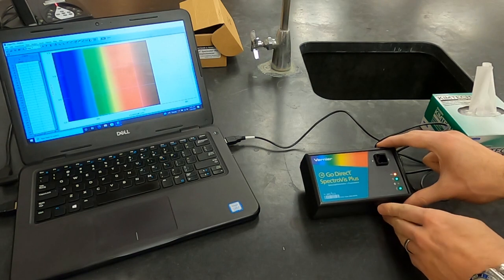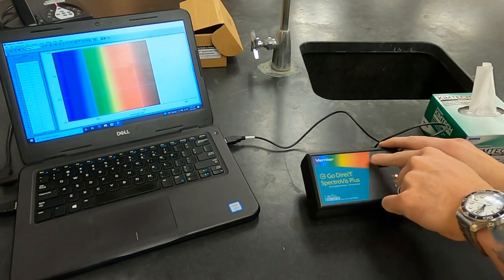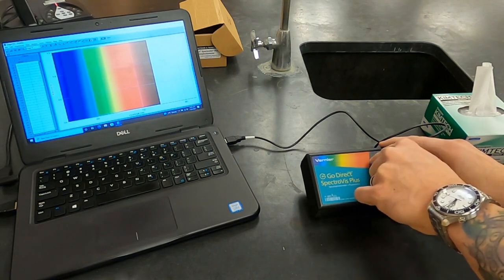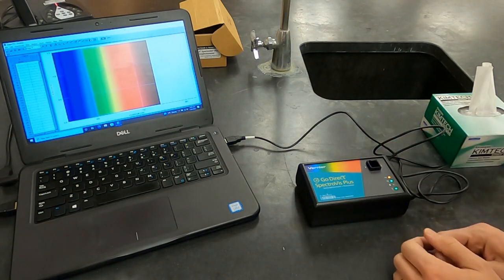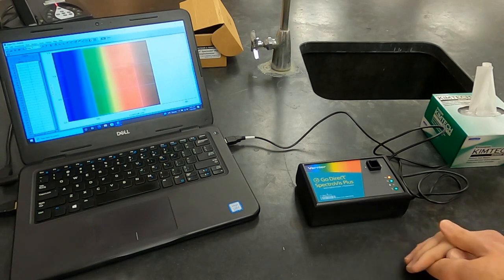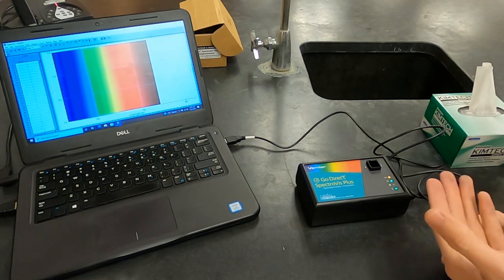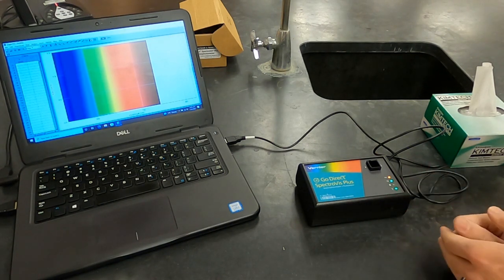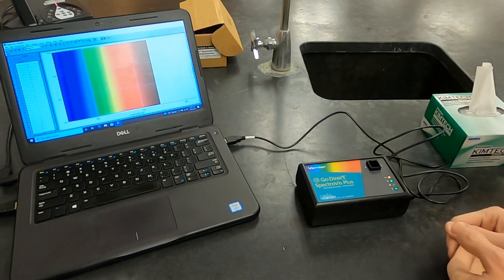What you need to note here is the white arrow here is showing that this is where light passes through. This is the path that the light takes. What this does is it shines light through a sample and it has a detector which will measure how much light is able to go through. That percent transmittance is then turned into an absorbance. It figures out how much light was absorbed. So it measures how much light goes through, but it will calculate and graph it if you ask it to, to instead graph how much light was absorbed for each color that it shines through.